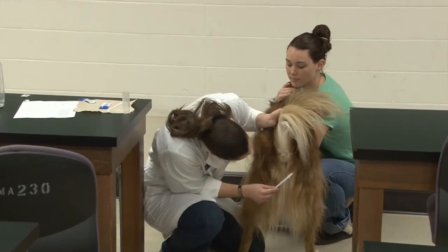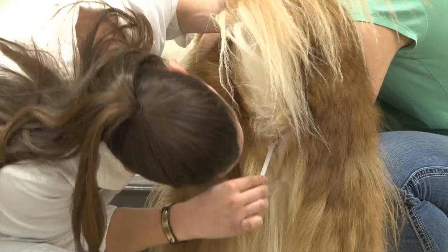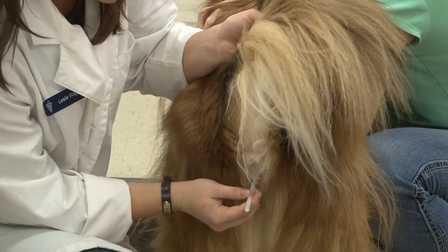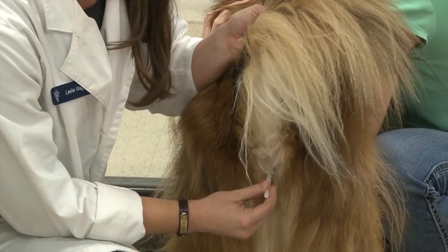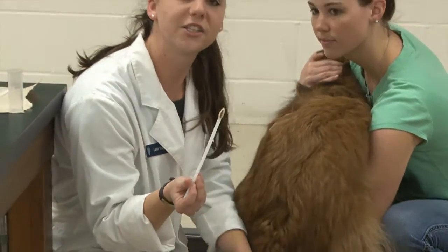Lift up his tail, wipe the lube across, and then insert it into the rectum. Once it's in I'm going to give it a twist, 360 degrees, to make sure to collect as much as possible, and then pull it out. And there's your sample.